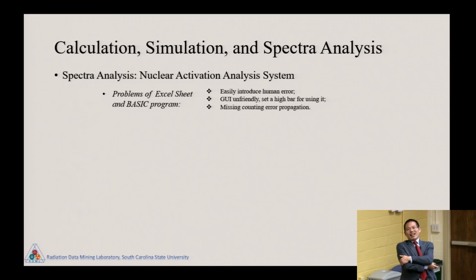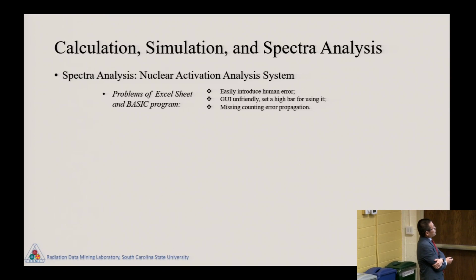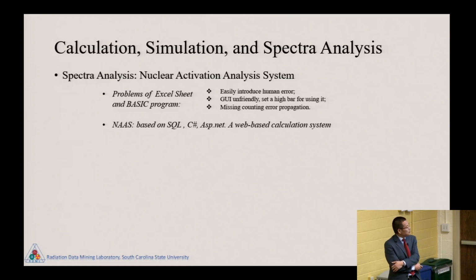This is software we designed, but there's an old software which has some issues. It's easy to introduce human error. It's user unfriendly, and sets a high bar for using it. It's missing counting error propagation, which I hate. They designed it with some Excel sheets and a basic program. That's the old one. The new one, we do with SQL, C#, and ASP.NET.